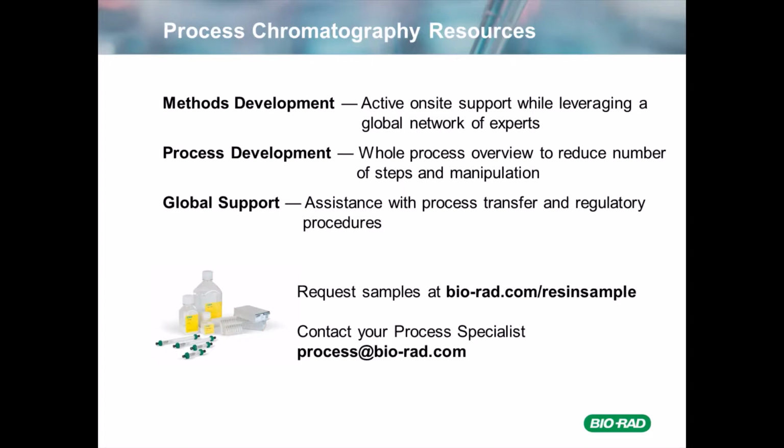Well, this is a good question, because we know that usually protein purification is probably a little bit more complicated than just pH and sodium chloride concentration. You can consider using buffer additives such as arginine, glycine, or propylene glycol. Arginine, for example, helps minimize the non-specific interactions and often results in better target recovery and selectivity.